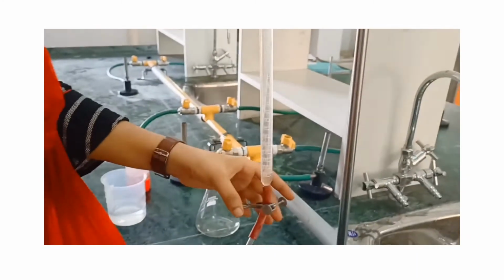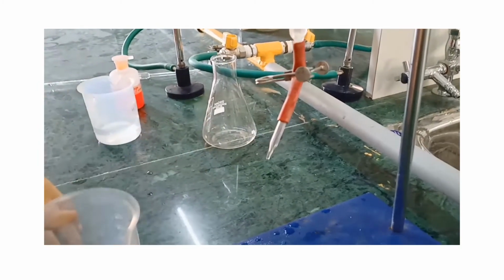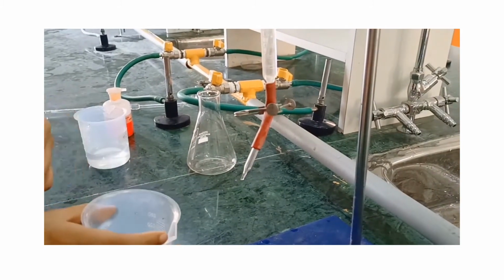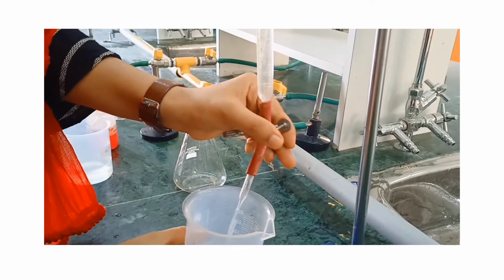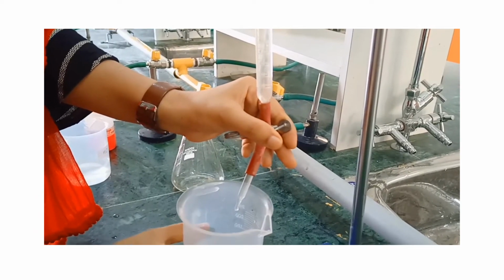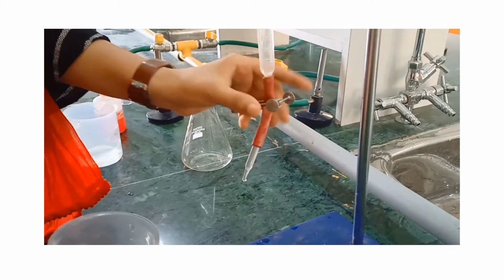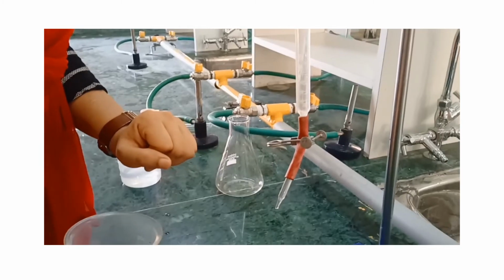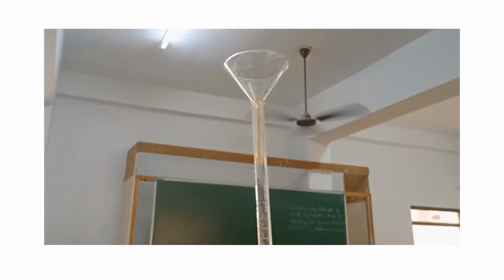Here you can see that there are some air bubbles. So our step is to remove the air bubble. How can we remove the air bubble? Then you can see that by fast opening, there will be removal of the air bubble. So here you can see that as we opened it, the air bubble got removed. Now here we will again fill it and make it up to the 0 mark.